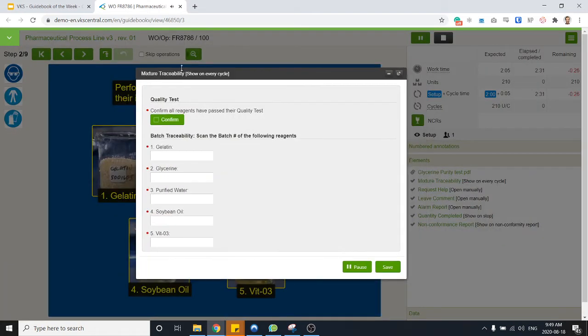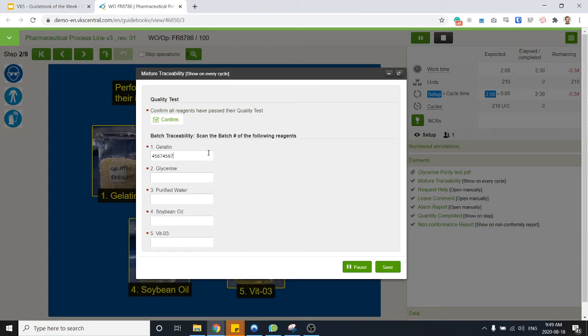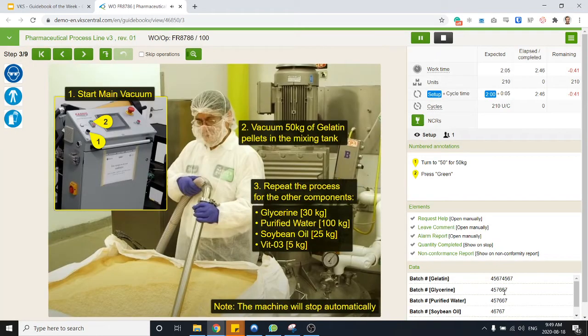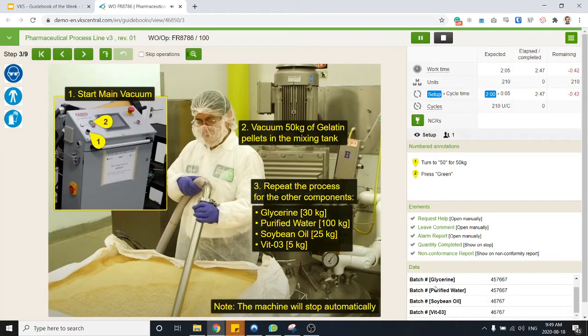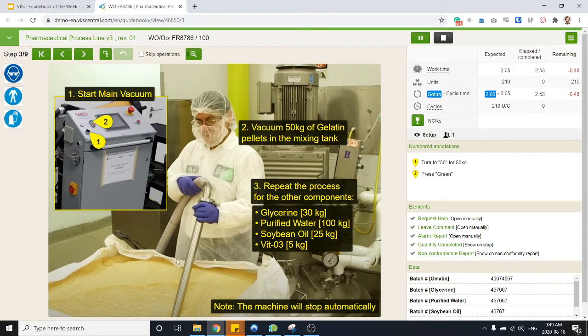And then of course we need to have traceability of what we'll be mixing together. So I can just confirm I've done my checks and then what I could do is just scan in the batch numbers of the regions I'm using. Every batch number now appears at the bottom right so I'm reminded of which one I need to use for the rest of my job.